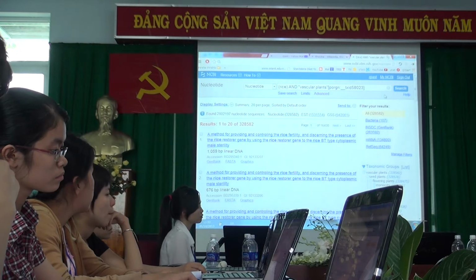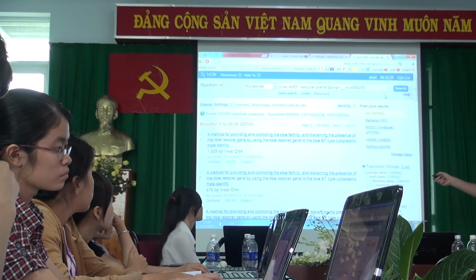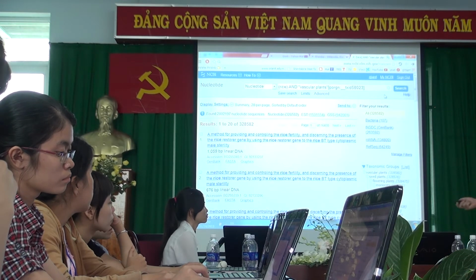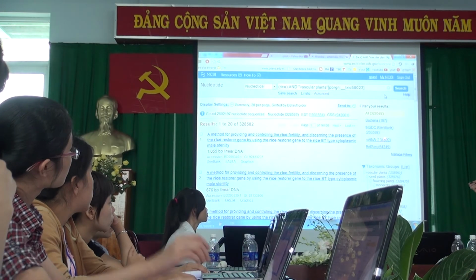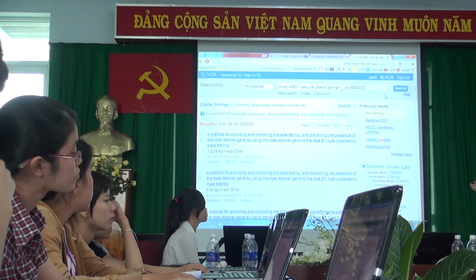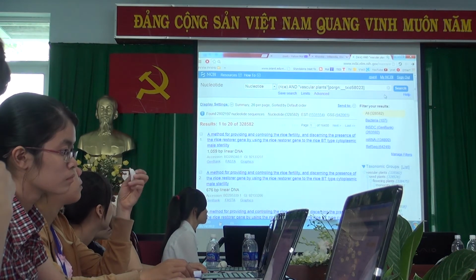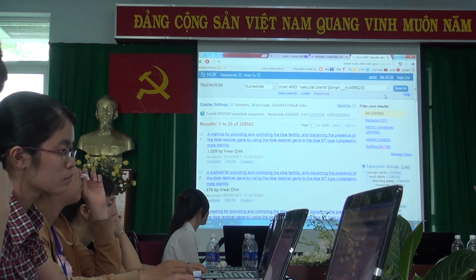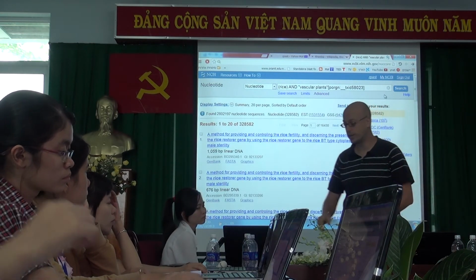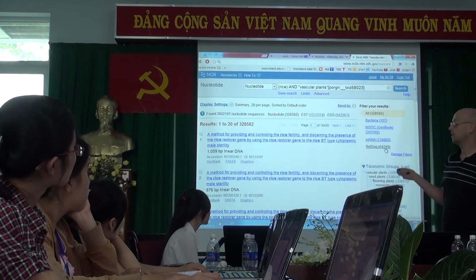If I wanted messenger RNA sequences, because nucleotide contains DNA and RNA sequences, if I clicked on mRNA, I would be left with 134,000 sequences which are messenger RNA. And if I wanted RefSeq, I would click here and I would get only RefSeq sequences.